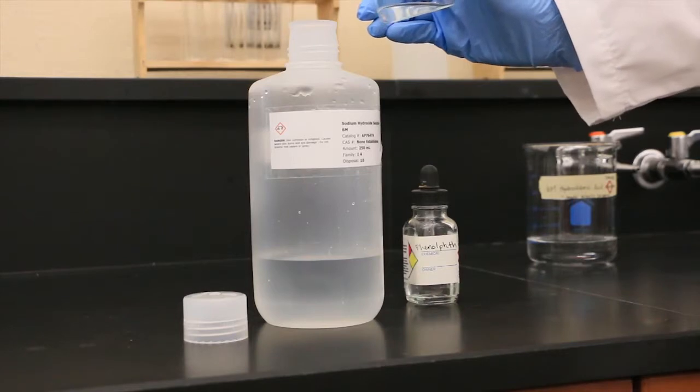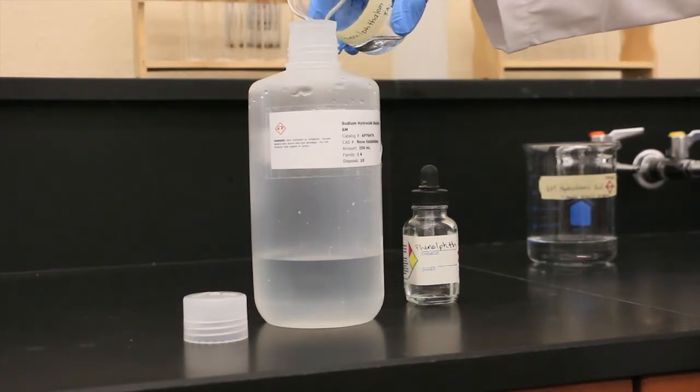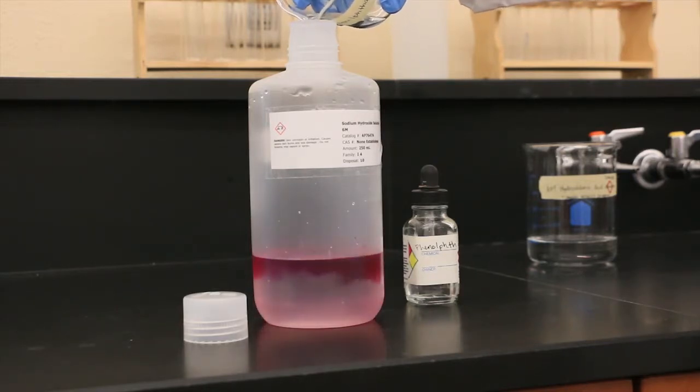Remembering to label your beakers filled with chemicals will help prevent you from having to identify anything. If a chemical happens to spill around electrical equipment, do not touch anything. Alert the instructor immediately. Even though it is sometimes very tempting, never place excess chemicals back in the original container. This can lead to contamination.